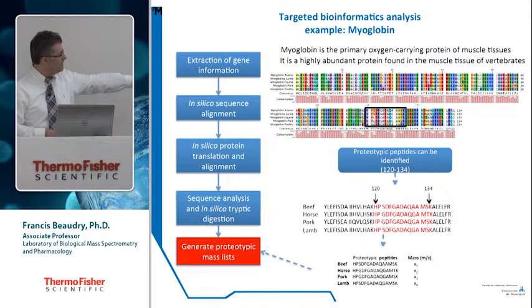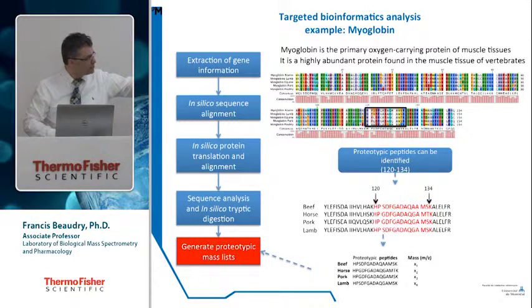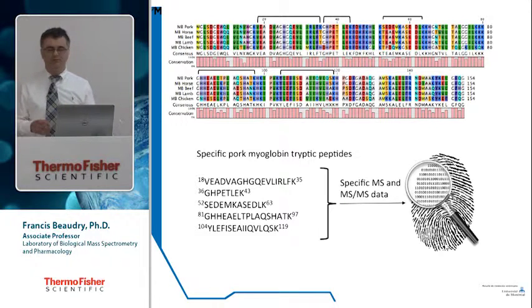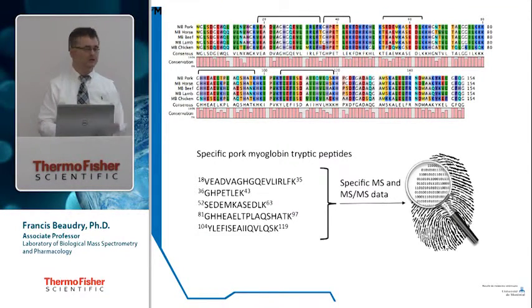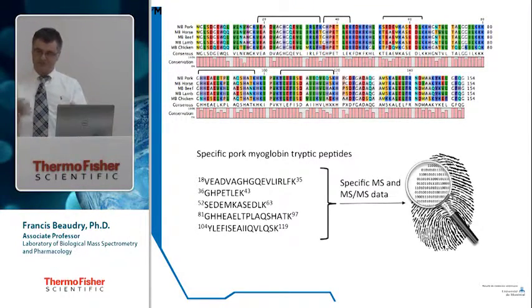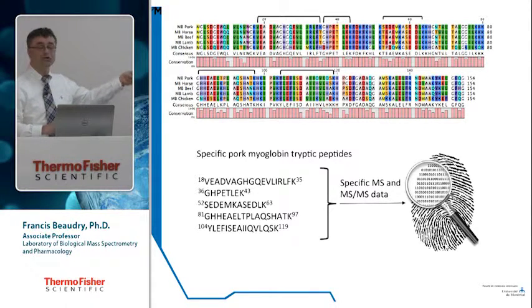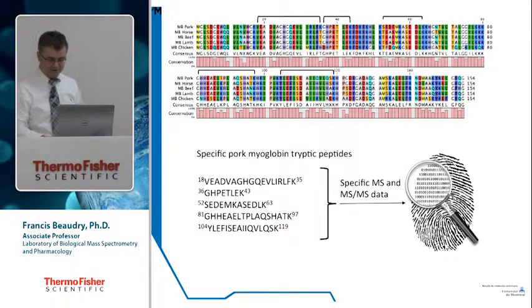So we can generate this way a very specific mass list. When I align them and I select the potential proteotypic peptides, I can generate the mass because the mass is associated with the specific sequence. And I see the sequences are not common. There are differences. From that as well, when I look specifically at myoglobin, I can identify other specific peptides, especially for pork. So I can still use myoglobin and monitor other peptides that are very specific to the pork. So not only can I use our specific proteotypic peptide, but I can use others. I'm not going to show the data for this, but it's available. And that's the beauty as well of using a Q-Exactive in full scan, because I can mine the data and extract that information afterwards. So that's a very important thing.